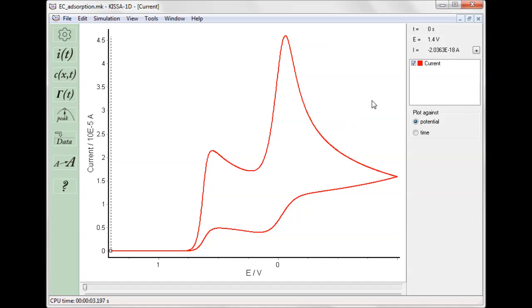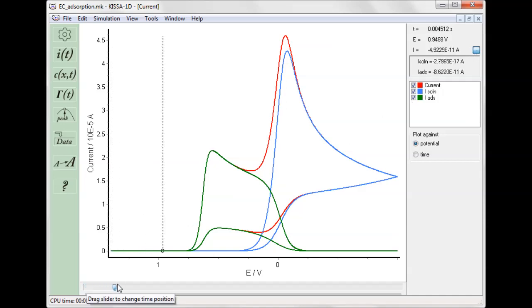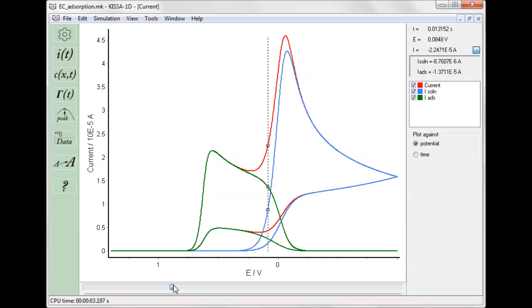These two current components can be displayed by expanding the current values panel on the right-hand side. The values of the total current and its components shown on the right-hand side correspond to the time moment and the respective potential selected using the slider at the bottom of the window.